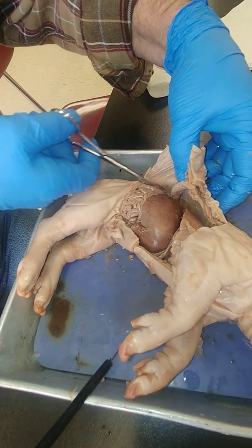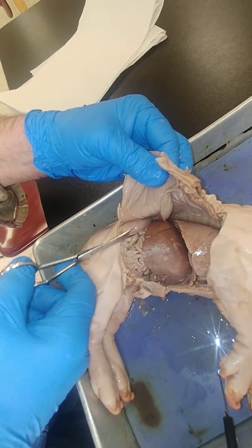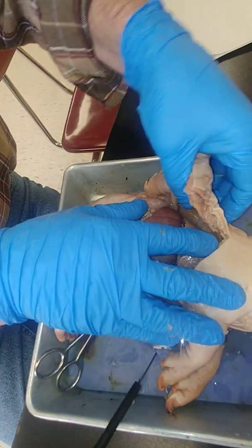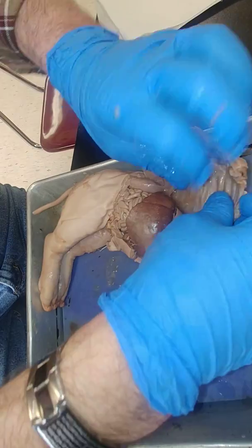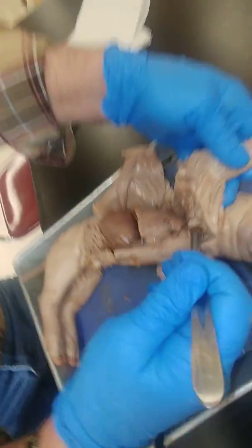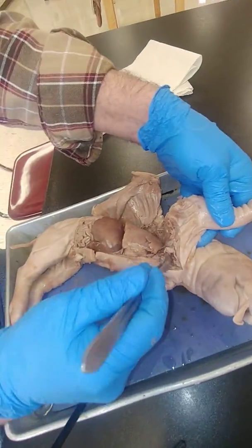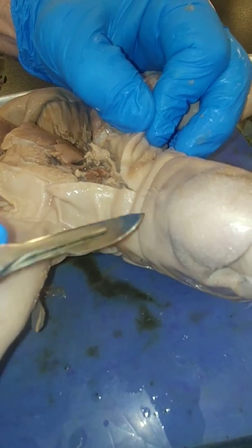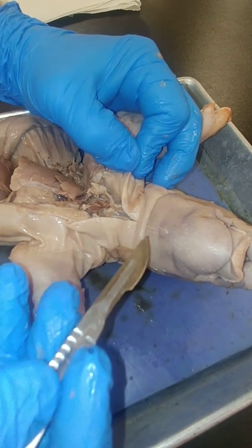And what I'm separating back here now are the kidneys. This will be the right kidney right here. And it had a membrane that was holding it to the dorsal wall of the pig. And we're going to break the ribs so that this stays open a little bit better. And then we'll go up in the neck area here. And if you ever heard the old nursery rhyme, not by the hair on my chinny chin chin, pigs have a little welt on the bottom of their chin there that's got a few sprouts of hair sticking out. What the purpose of that is, I have no idea.